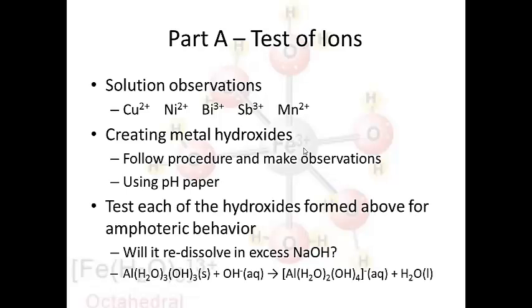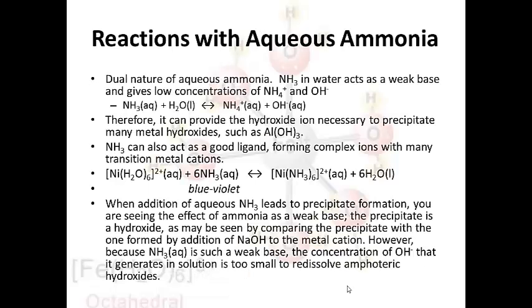Once you've created your metal hydroxide and made your observations of what these hydroxides look like, you need to test each of these hydroxides for amphoteric behavior. Will they redissolve in excess NaOH? That's really what you're looking for. Then you'll move on and perform reactions with aqueous ammonia.